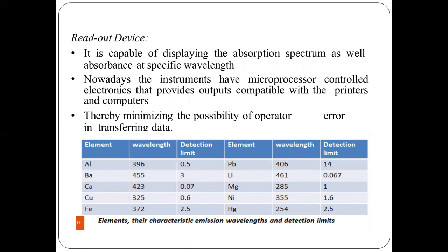What kind of reading do they show? When any element is burned at a specific wavelength, its detection limit is read out.